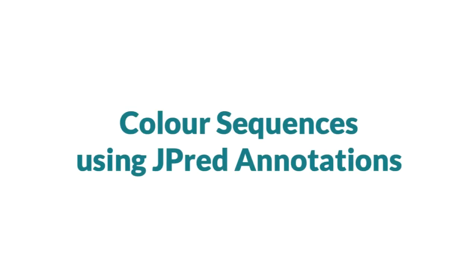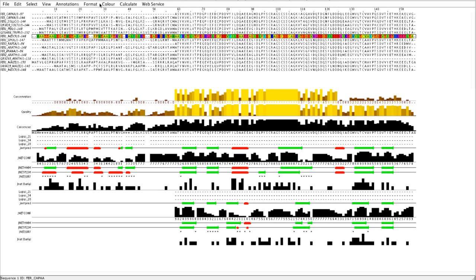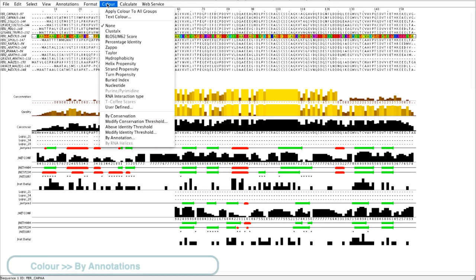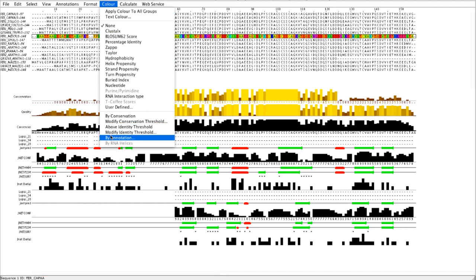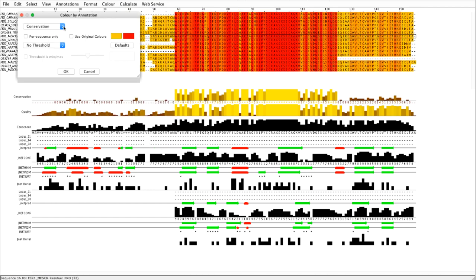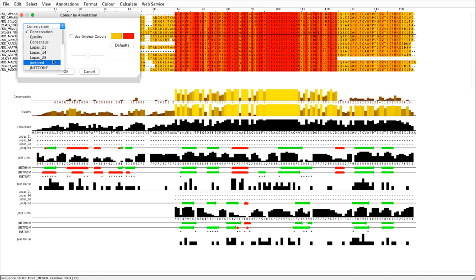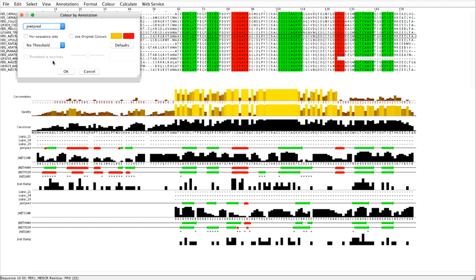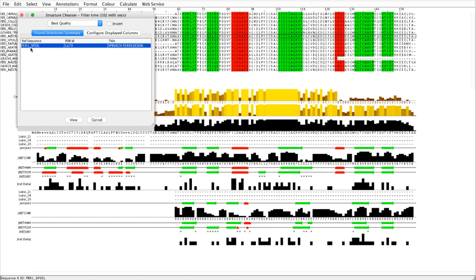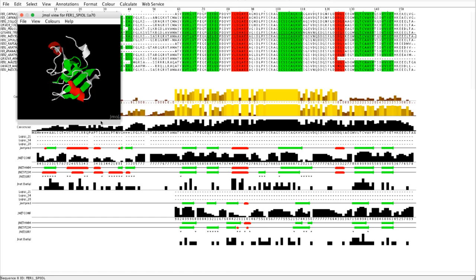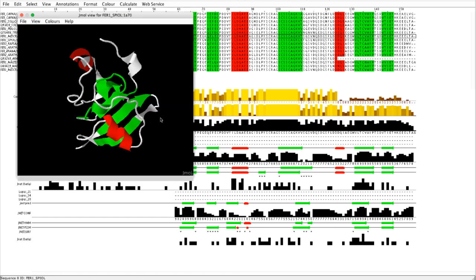The JPRED prediction can be used to color the alignment by going to the color menu, select color by annotation and select the annotation required. If the 3D structure is known for one of the proteins in the alignment, then JPRED can be used to color the structure.